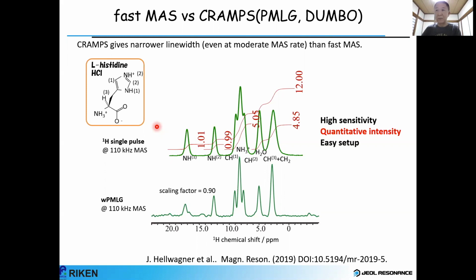So at this moment, I think this is a very big issue, especially for pharmaceutical applications. If your sample has an aromatic ring, we have large anisotropy in the magnetic susceptibility tensor, and that typically results in a broadening of 1 ppm or something like that. This is huge for a proton NMR experiment. I think we have to solve this in maybe 5 years or 3 years.